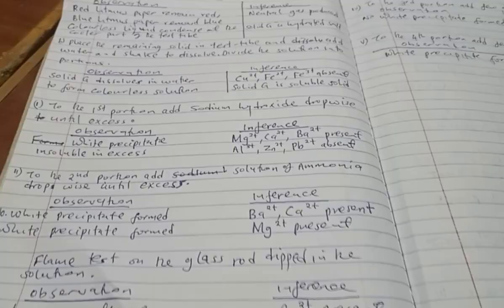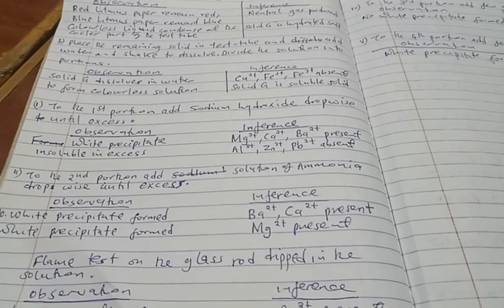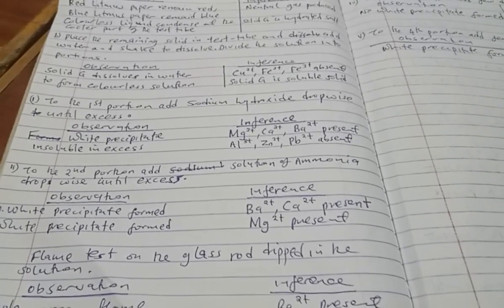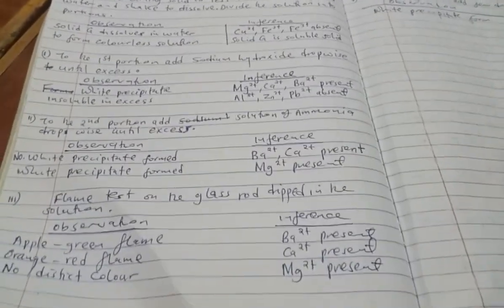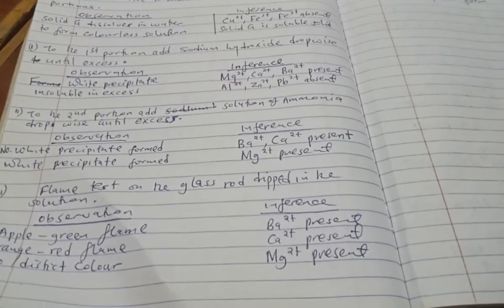How do we separate them now so that we get one of them? You separate them using flame test. So for this flame test, you use a glass rod, where you dip it into the solution and burn on a non-luminous flame.